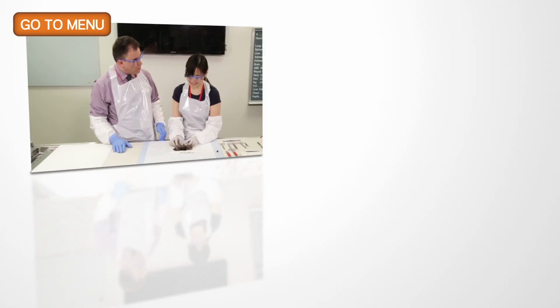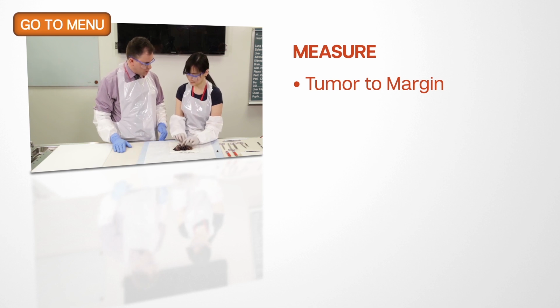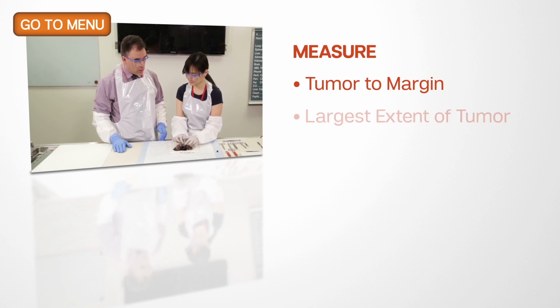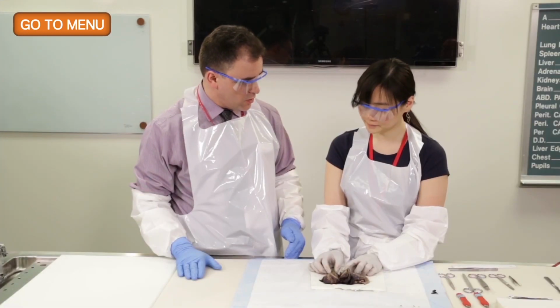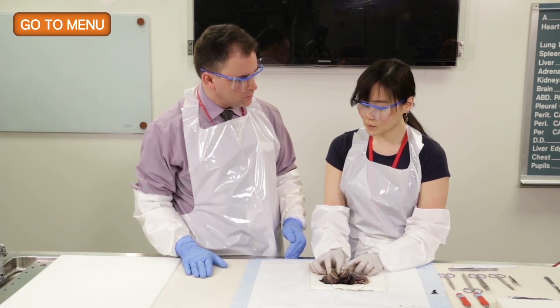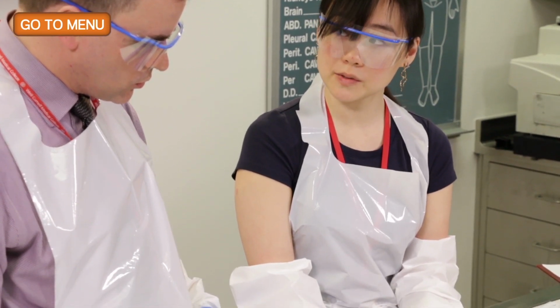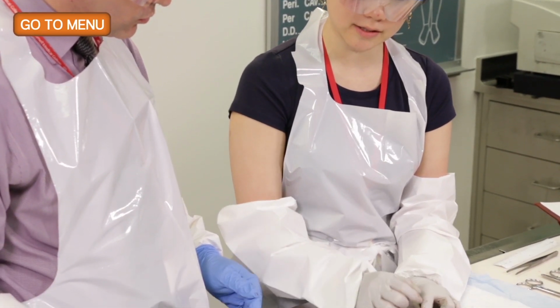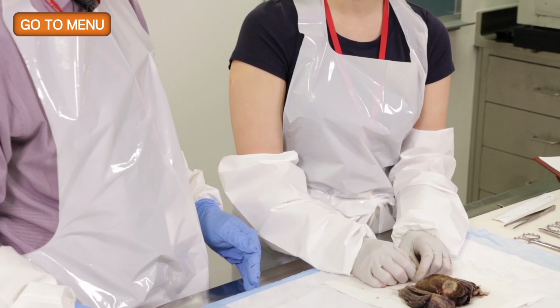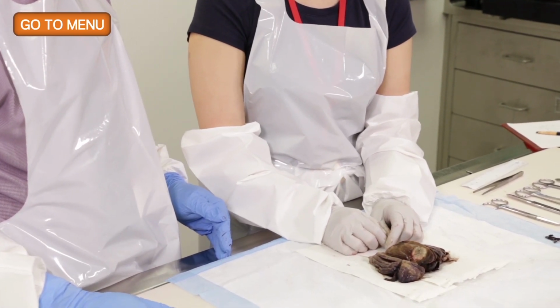Okay, so now the measurements that are important are the distance of the tumor to the bronchovascular margin, which we assessed was not close. Right. And we've confirmed that assessment, and as well the entire longest dimension of the tumor, which is the most important for staging. And then the last thing is how do you want to deal with the pleural pucker? Well, for the pleural pucker, I believe we need to have a minimum of 2 sections, 2 full sections, so we can have proper assessment. Okay, and so why don't you go ahead and do those measurements, and then we'll proceed.